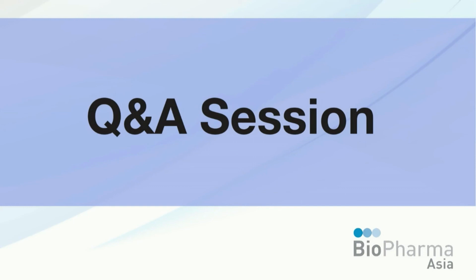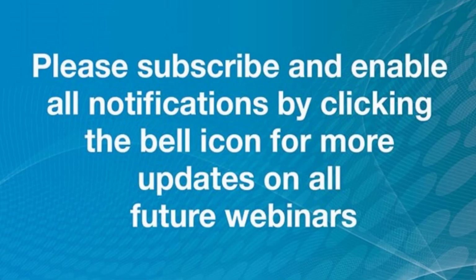And our next question is, are pellets of irregular shape? If yes, coating for taste masking can be an issue. This is a very good question. I think I mentioned that in my presentation. Usually pellets, if you standardize the process, have a very accurate size and shape. So if you extrude the material, you obtain these strands. We call them strands. They look like spaghetti. And you adjust the pelletizer so the shape is cylindrical with a very accurate size of about 1 millimeter, and you can extend that to 1 to 3 millimeters. So the shape is very regular.